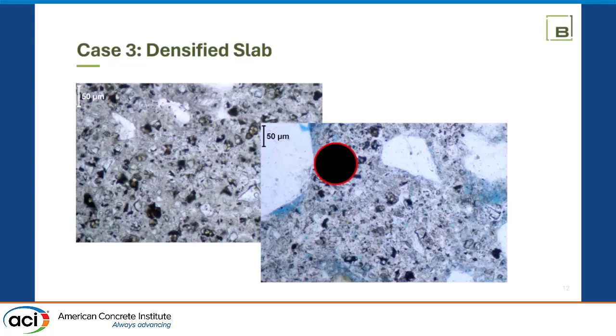But I'm lying about the size of the dot. The instrument actually shoots that dot. So, oops, you have to move around a lot because the dot is smaller than the original Portland cement clinkers, because you could technically hit it. So you've got to get an average moving around.